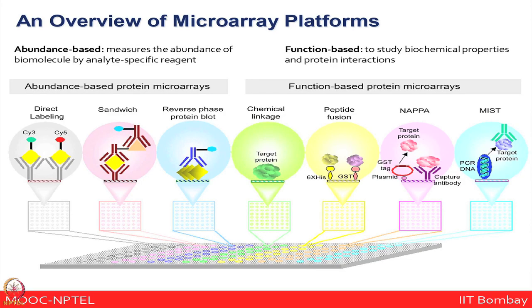So, technologies like nucleic acid programmable protein arrays or NAPA, or multiple spotting techniques, are promising approaches to do these cell-free expression based microarrays, but all of these 4 which I have shown are possible ways to look at the function of the proteins. So, in some way, there are a variety of platforms available for doing proteomics, especially even interactomics using microarray based workflows.